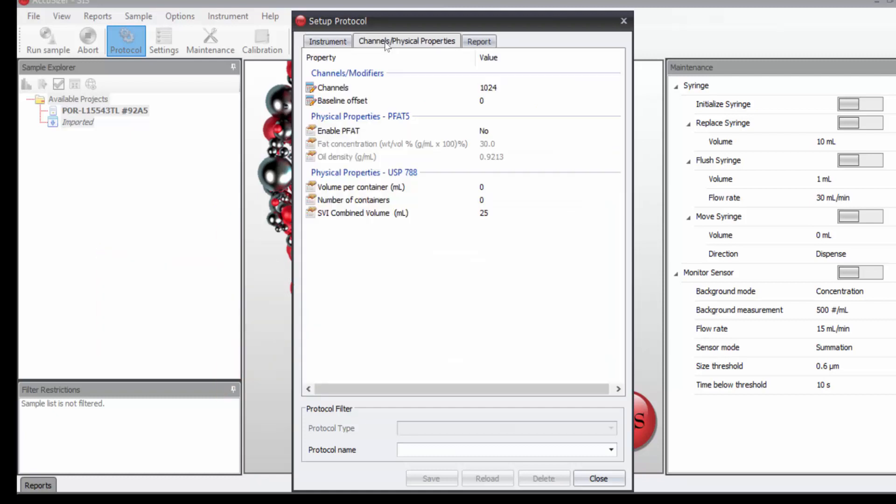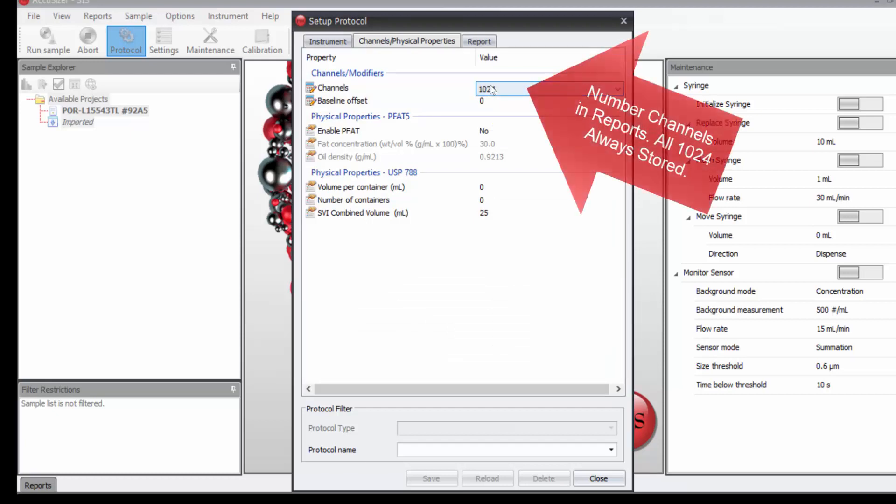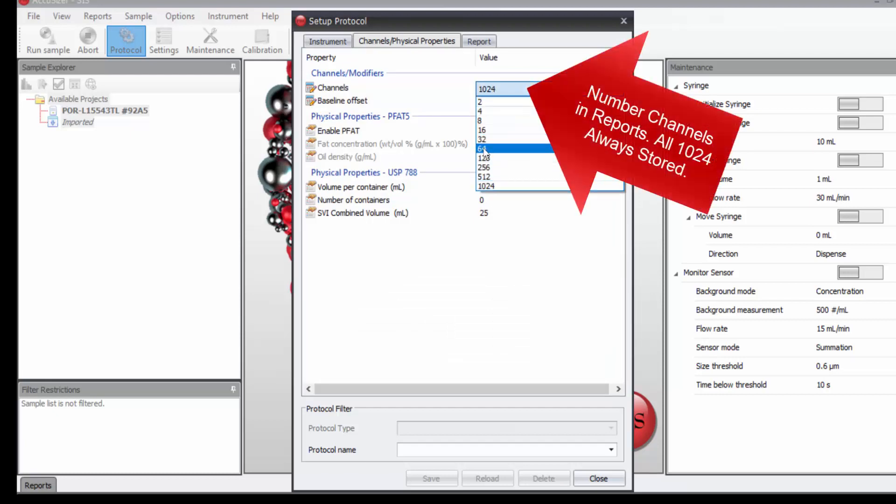Now we move over to the second tab. Here I'm going to reduce, we have a total of 1024 size channels in this counter. But I'm going to reduce that to 64, I don't need that many channels.